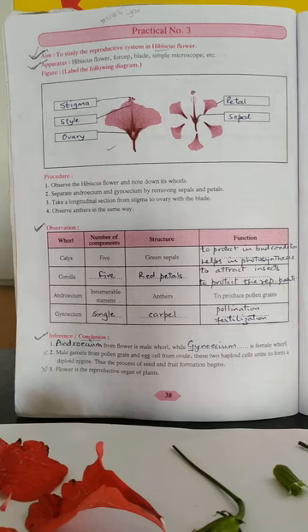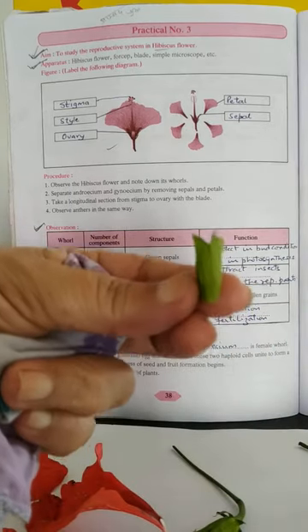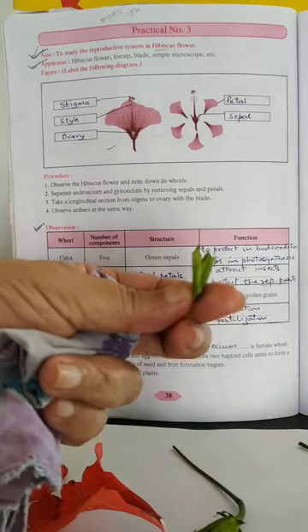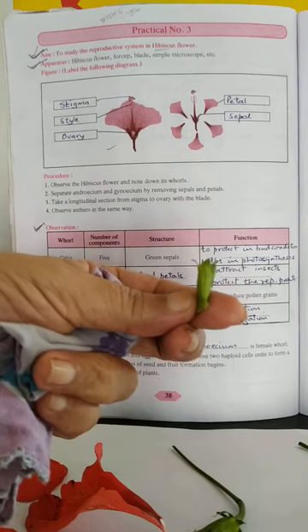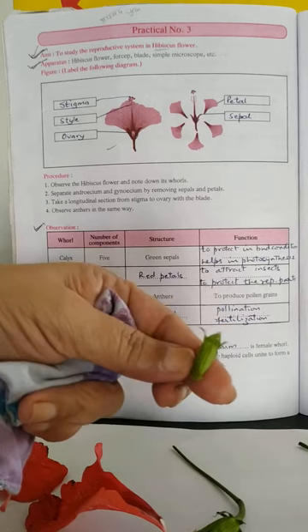Now, as you can see in the diagram, we had also studied in the theory the different parts of the flower, but here we are going to study only the reproductive part, but still we are going to revise all the parts of the flower. The outermost part of the flower, that is green in color, is called as the calyx. This is the calyx. It is made up of single unit called as sepal, and it is green in color.